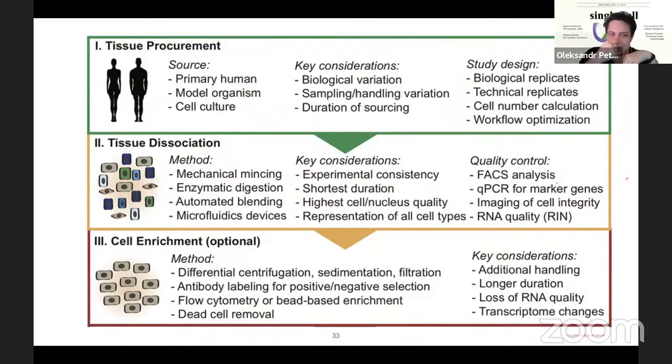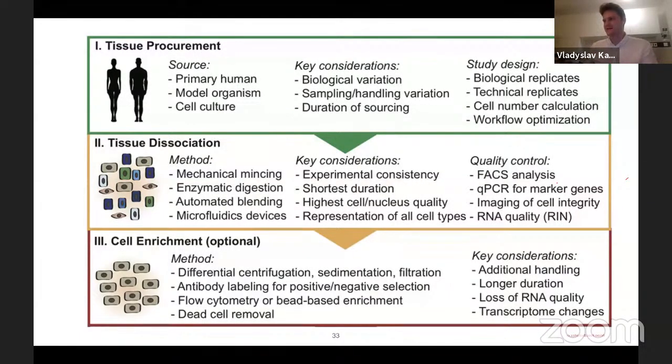So what can you say about the tissue dissociation step? Marina, Vladislav, any specifics regarding the liquid tissues here? Actually, the only thing is, when you want to target some immunological moments in the blood, you would probably need to isolate PBMCs. That would be the only step required for the tissue processing. To keep it super simple, we invite patients to enroll in our clinical trial or this study, and we make a venipuncture. The first thing that you take is blood.